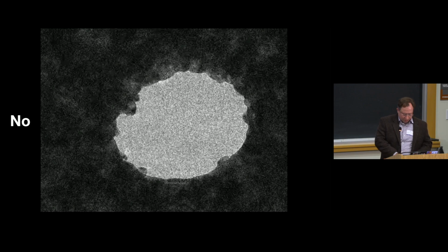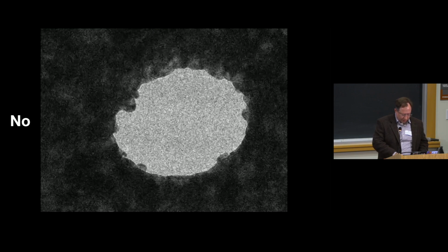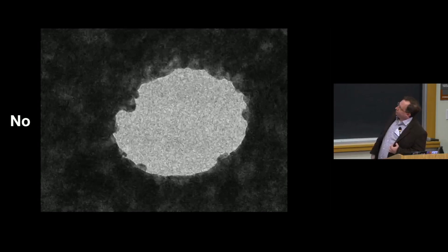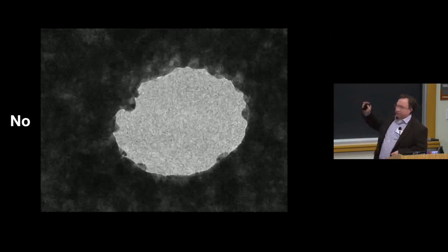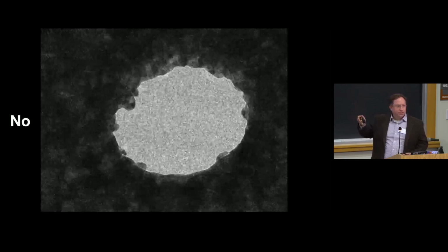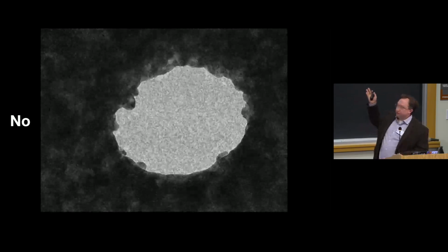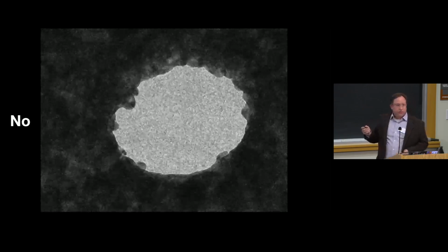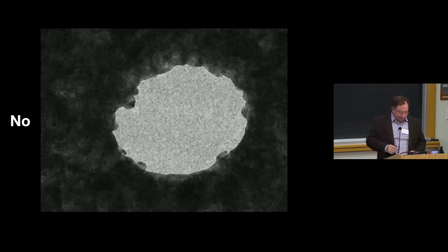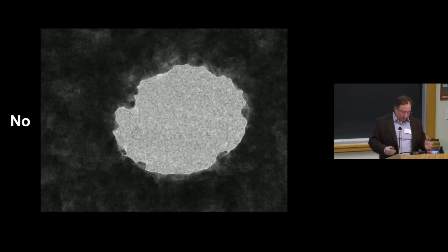So this is an image of one of these 300 nanometer holes at 30 degrees tilt, and I'll play the movie of it so you can see it's looping through. So at liquid nitrogen temperatures, this would be absolutely motionless. But at helium temperatures, it's moving, obviously. So something has changed here, right? And so what's going on?